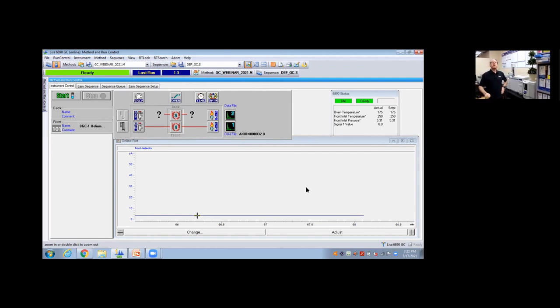We're in this 120 year old building, it's a beautiful place, and we have eight HPLCs and 13 GCs set up just for our training courses for you guys to come here and take them apart, put them back together, and figure out how they work. We have a bunch of stations like this with an LC GC sit next to one another. Another LC GC, slightly different models here and there. To me, it doesn't matter what maker model you have of a GC or an LC because you got to set the parameters the same way. Over here we have one lone FTIR. You got to have some spectroscopy in here, right? Another LC and GC stack. Here's our GC mass specs, another GC, another GC. This one has an ARC detector on it, very neat for looking at things like carbon dioxide, carbon monoxide, formaldehyde, formic acid. Here we have our gas system. So here's our hydrogen generator. We sometimes refer to it as our house plant because we have a house plant on top of it. It just reminds us to water it.